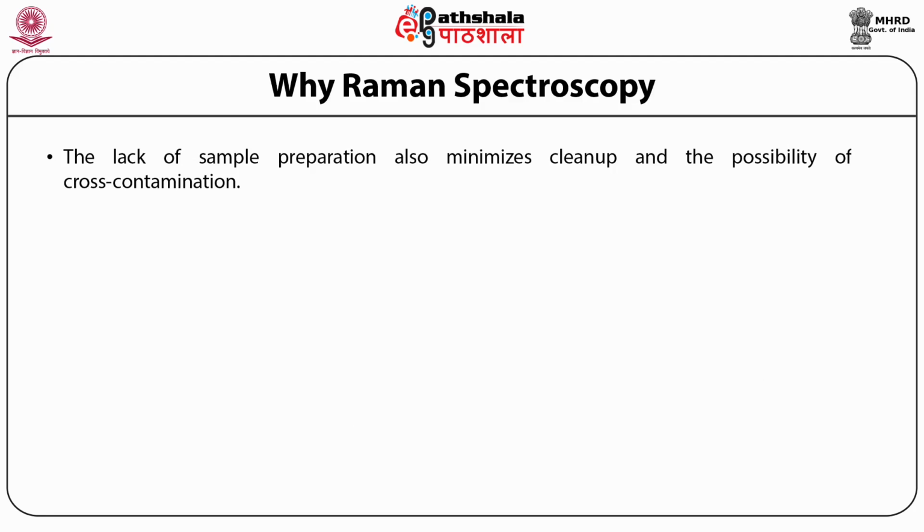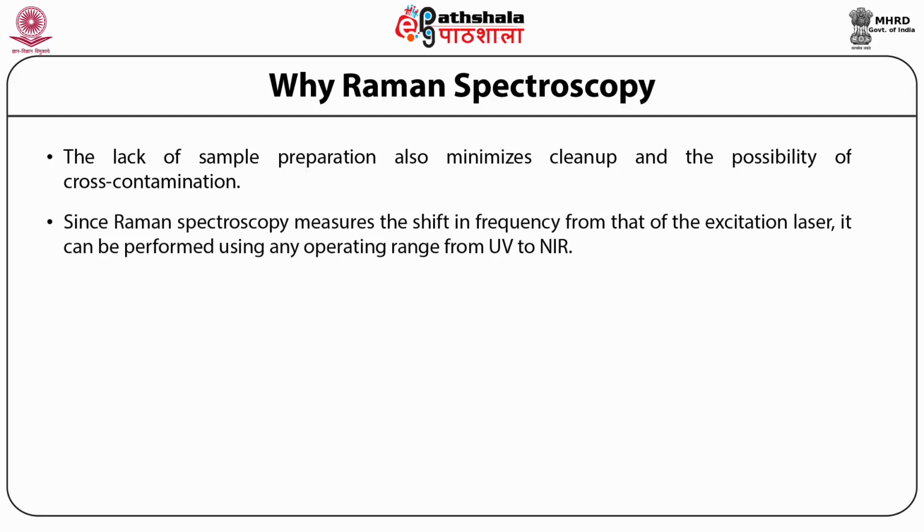Raman spectroscopy also has several advantages. Unlike other vibration techniques, its operational wavelength is usually independent of the vibrational modes being studied. Since Raman spectroscopy measures the shift in frequency from the excitation laser, it can be performed using any operating range from UV to NIR.